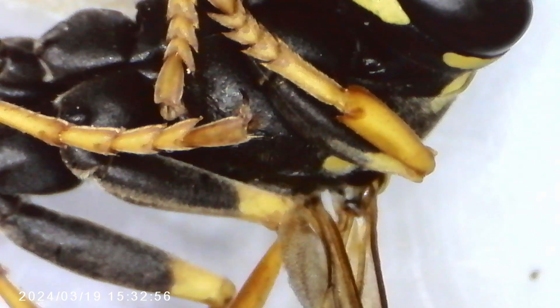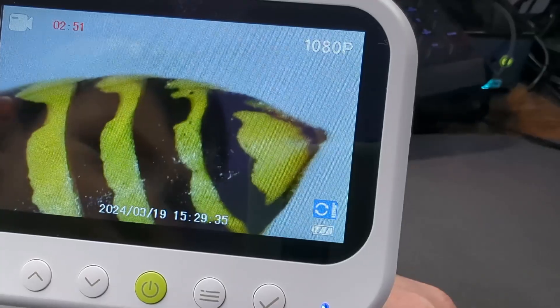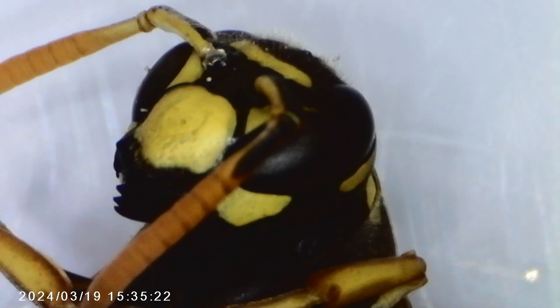My son got a yellow jacket from outside and we've been spending the night looking at that. I didn't know it was still kind of alive, but it was moving around. We could see it moving its stinger in and out, moving its legs. This microscope makes everything so fascinating.